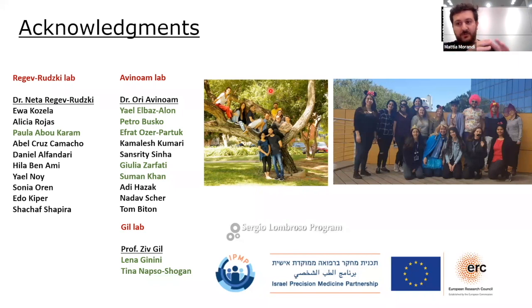We do a bandpass filter to remove all the smaller and the larger information, so that really the bilayer gets really nicely contrasted. The tomograms, on the other hand, are acquired at 300 kilovolts with 0.2 nanometer resolution, but then in reconstruction we bin them.